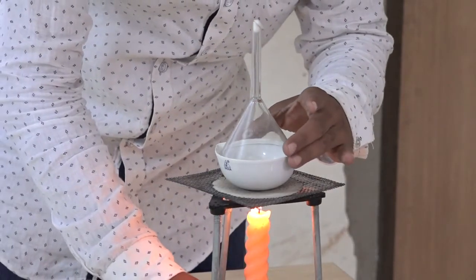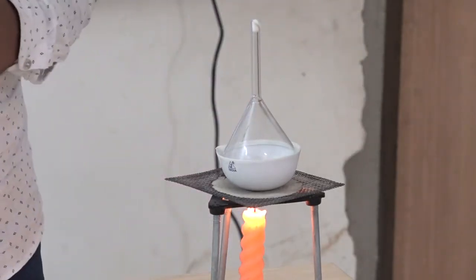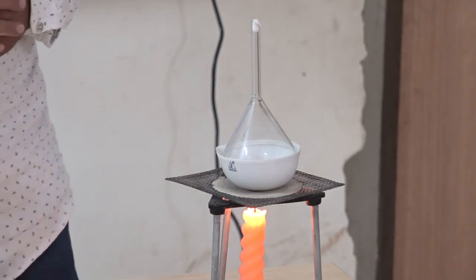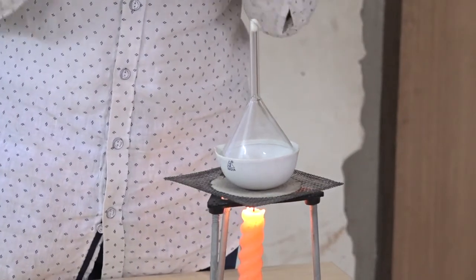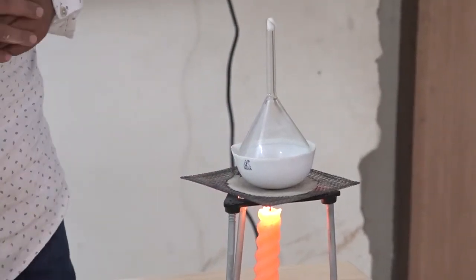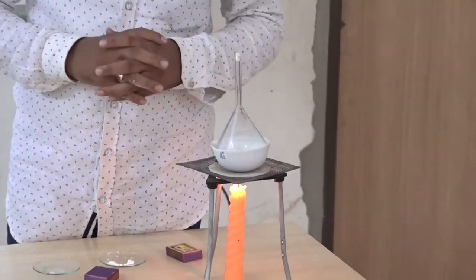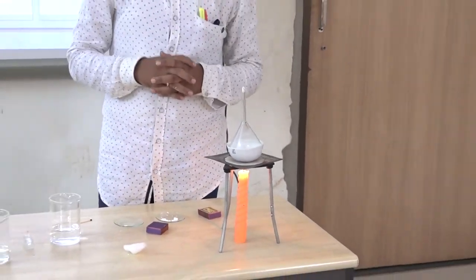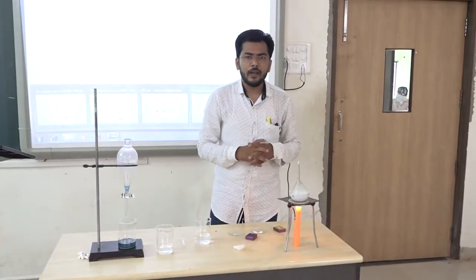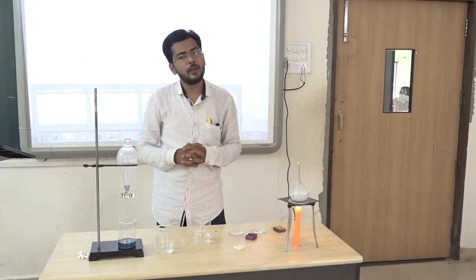By providing heat, what happens is that ammonium chloride converts from solid directly into the vapor phase. And these vapors are collected on the walls of the funnel. And chalk powder remains as it is in the evaporating dish. In this way, we can separate these two mixtures, one sublimable and one non-sublimable. We can separate them with the sublimation process.